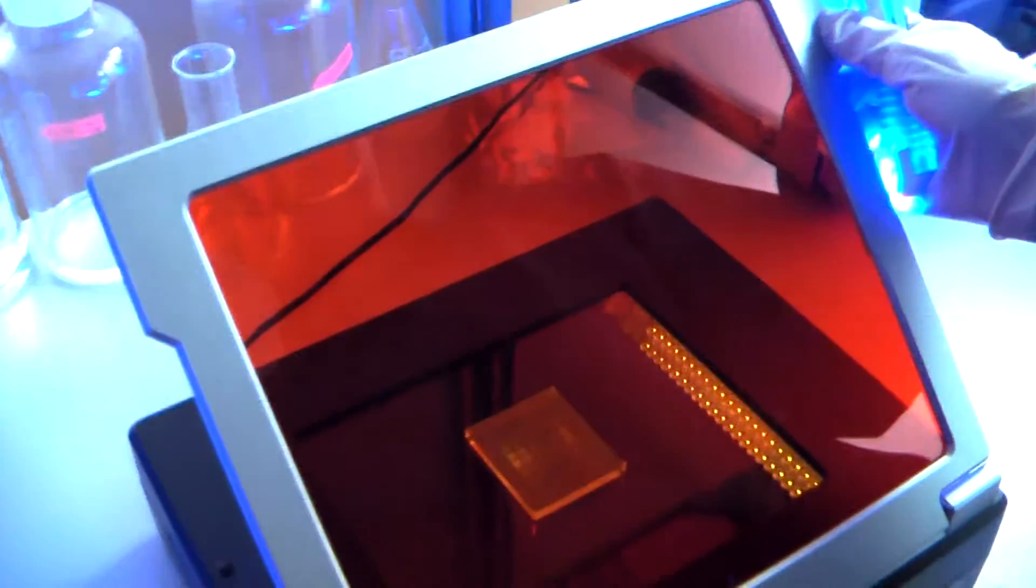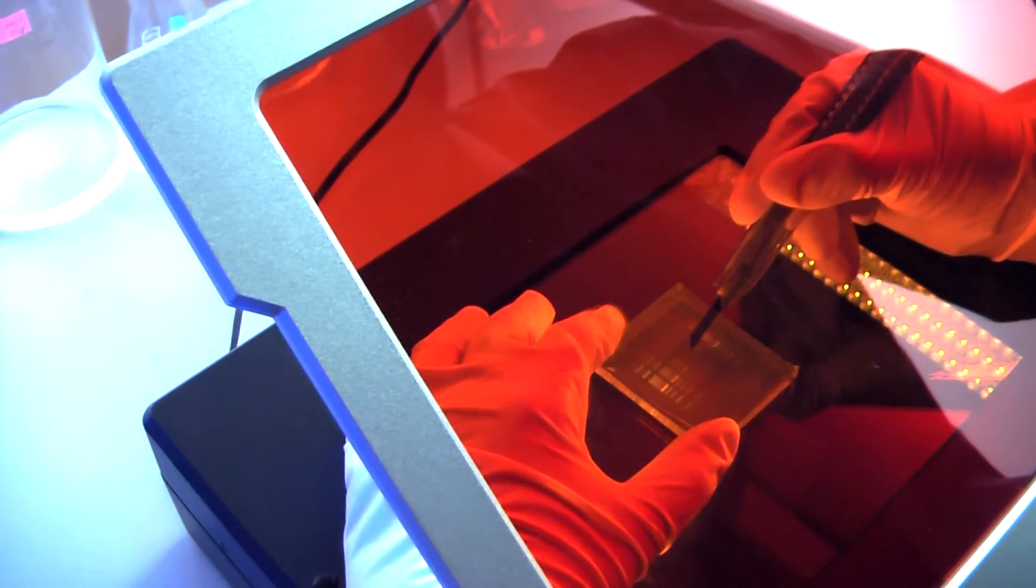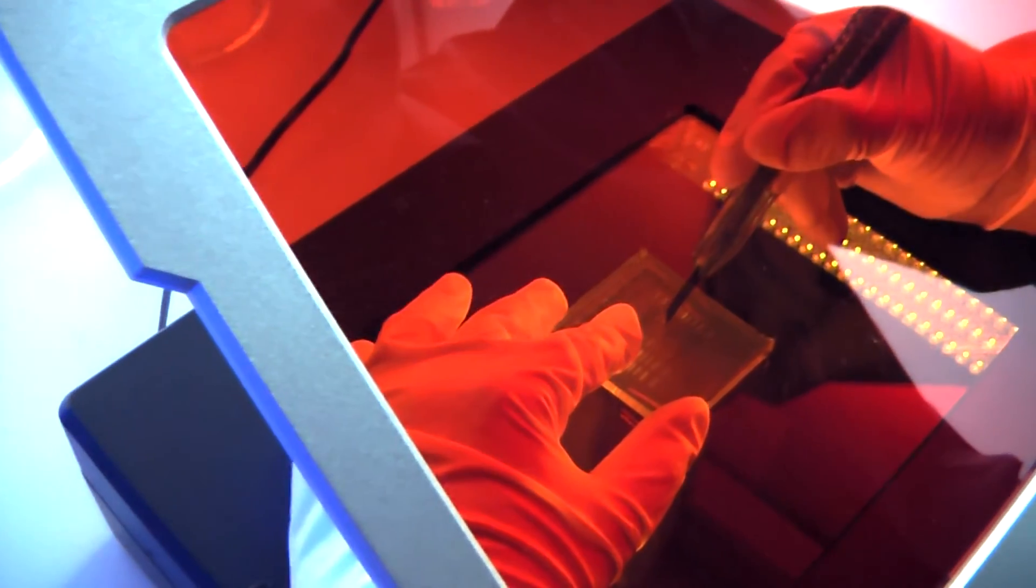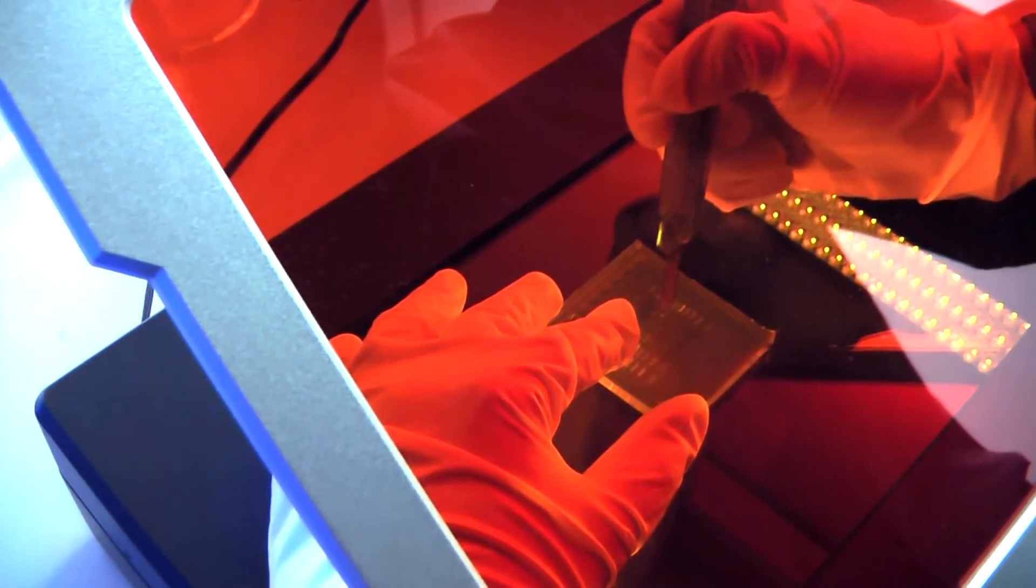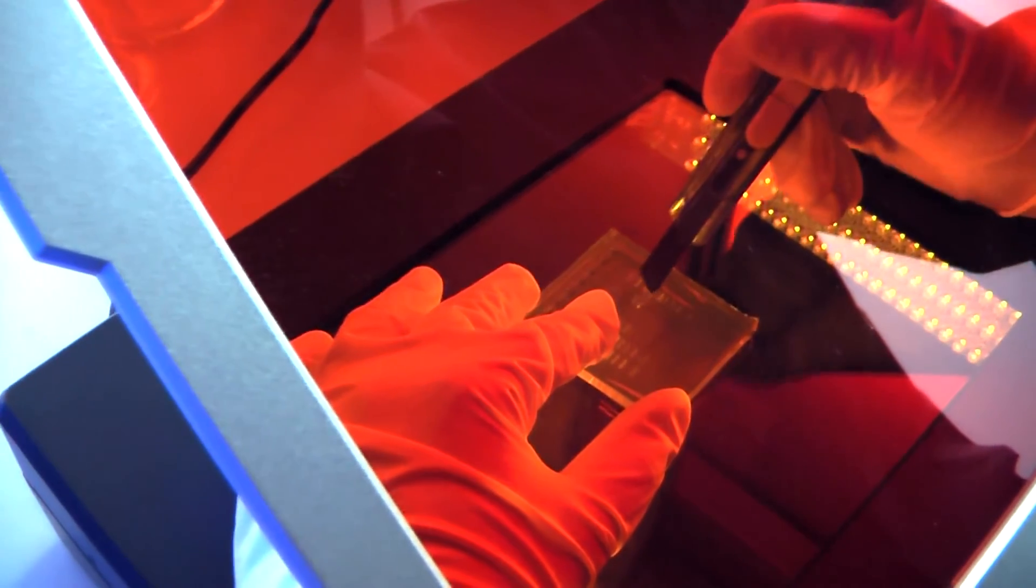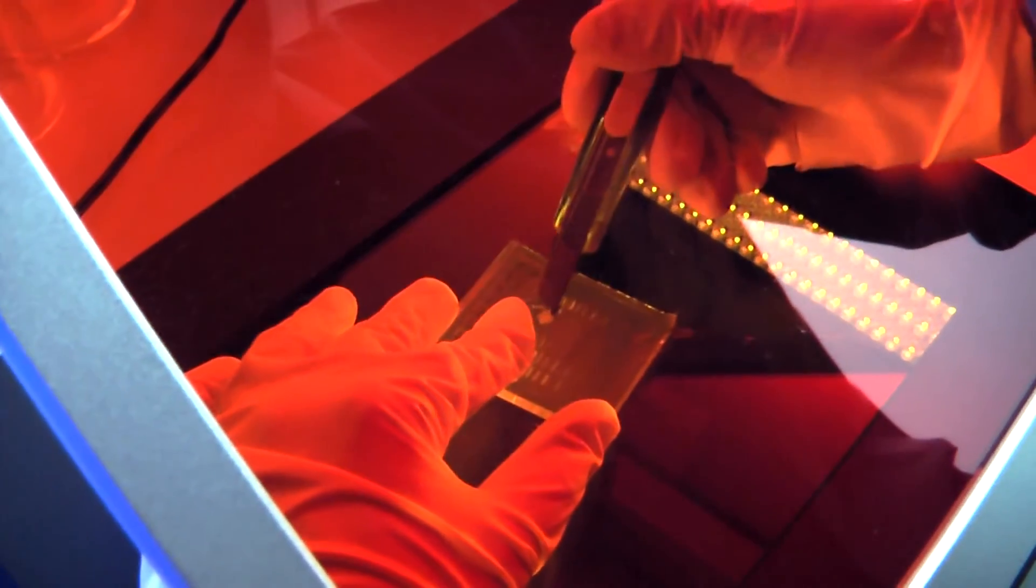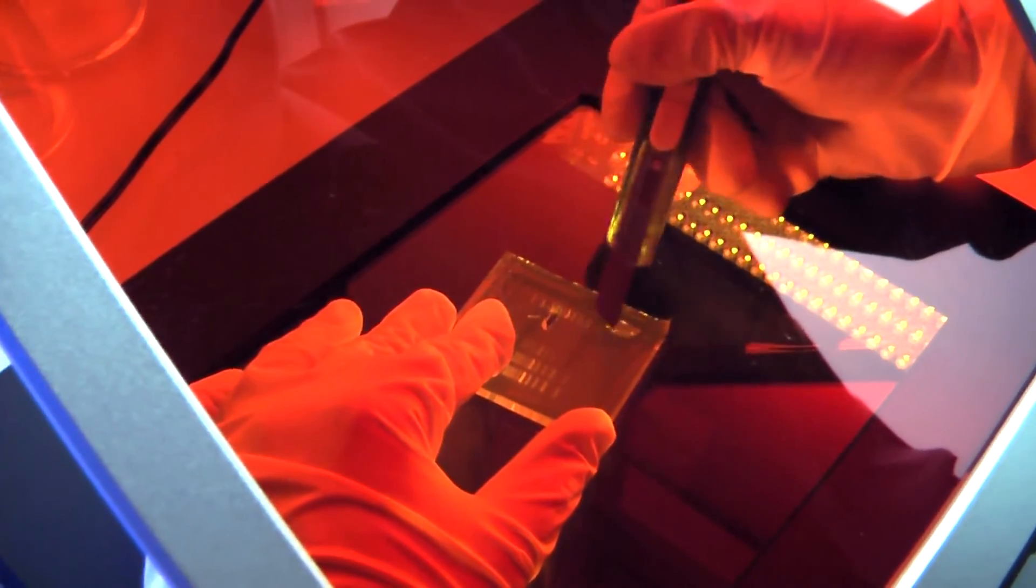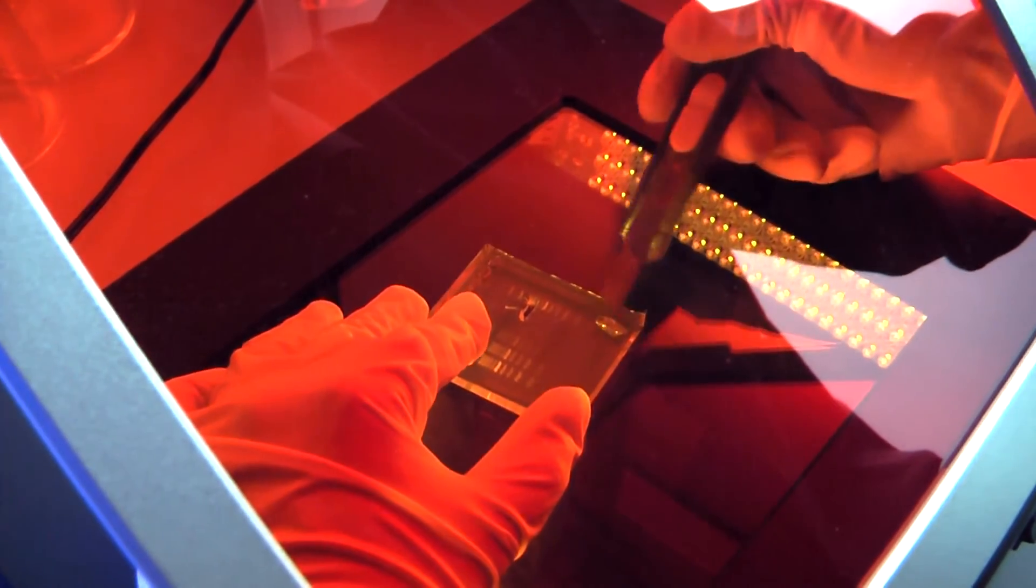The Mestrogen LED Trans Illuminator is very easy for gel cutting, produces a uniform fluorescence effect, and is also safe for both skin and eyes. It allows long-time operation without destroying DNA samples or your health.